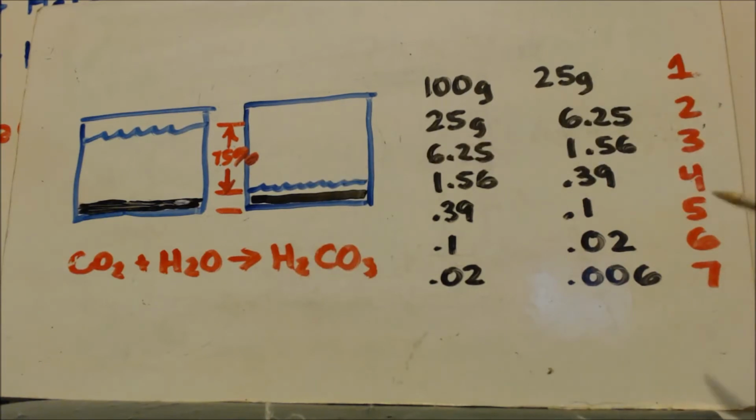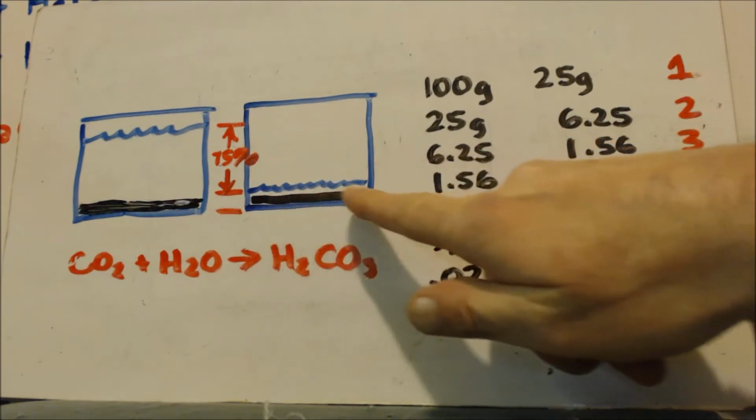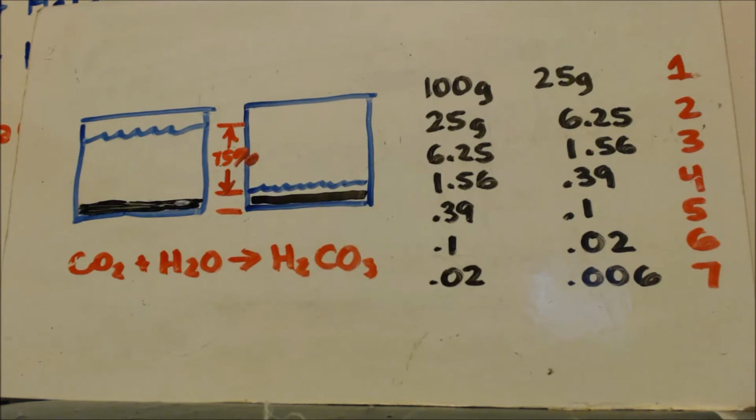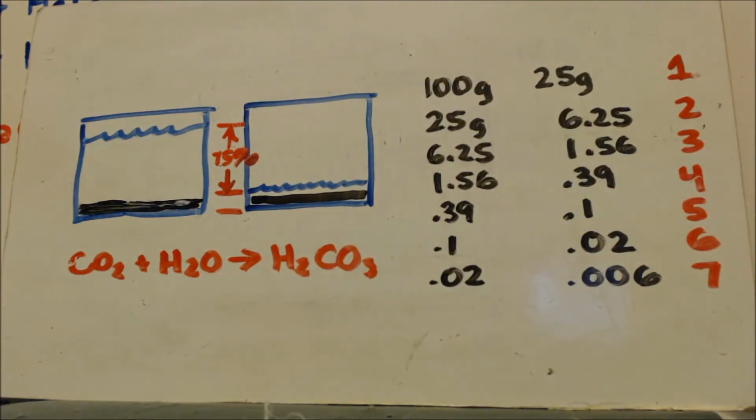But if you're making a lot, to have 0.1 or 0.3 or even 1 gram, it'll be an impurity, but 0.3 grams out of this, this might be 500 grams of stuff. That's nothing, man, because that's divided evenly among the 500 grams or 100 grams or whatever you got in there of your hydroxide. So I fill that up and I siphon it out. Fill it up, siphon it out. I do that like 5 or 6 times, or however many times I want.